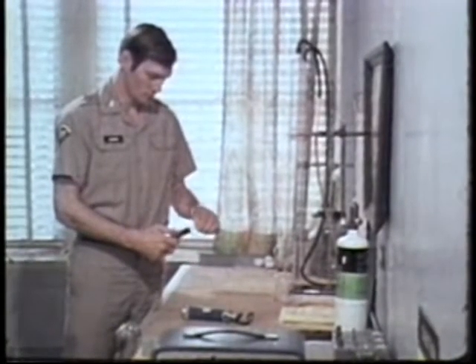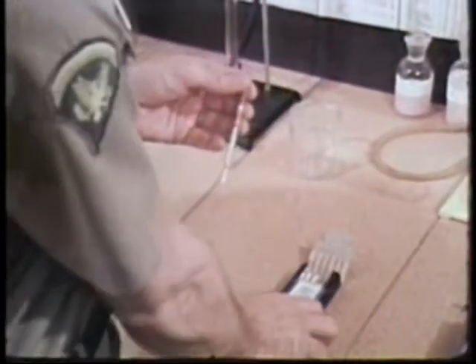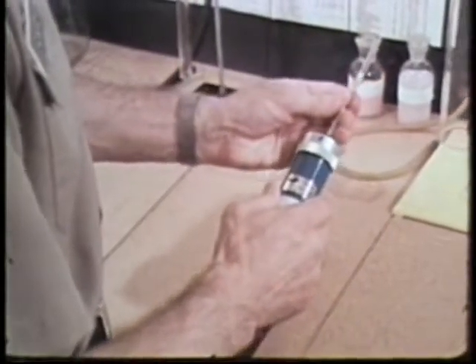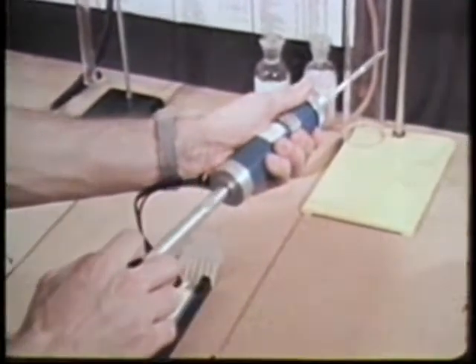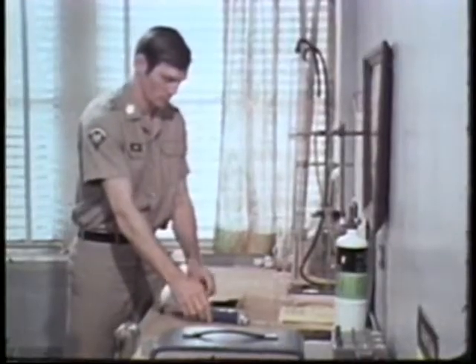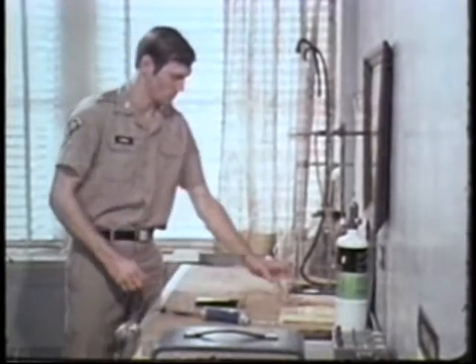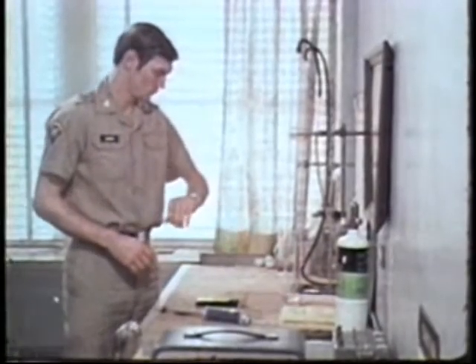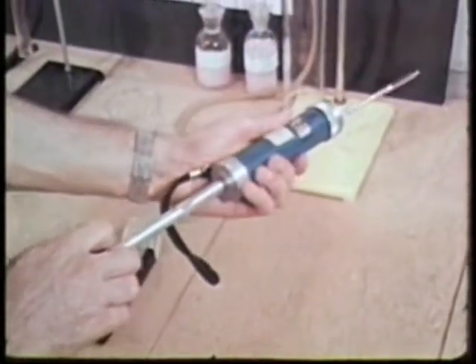Check the pump by doing a field leakage test. Insert a detector tube without breaking the ends. Pull out the piston until it locks and wait for two minutes. At the end of that time, let the piston back in gently.